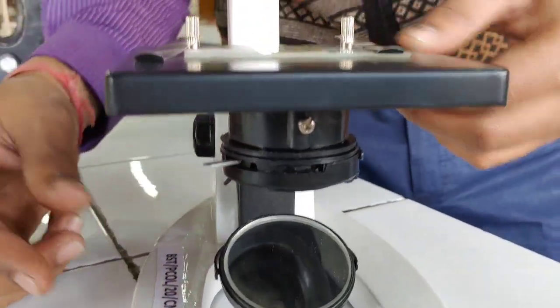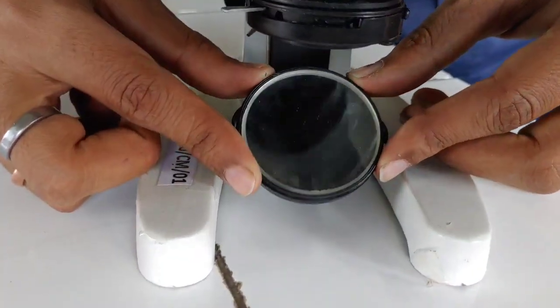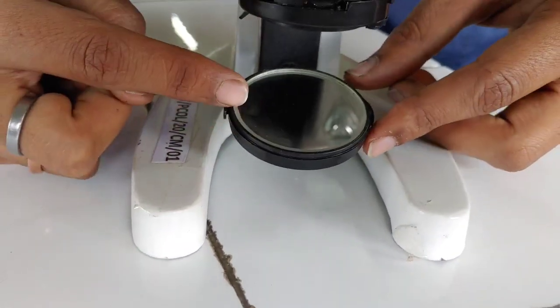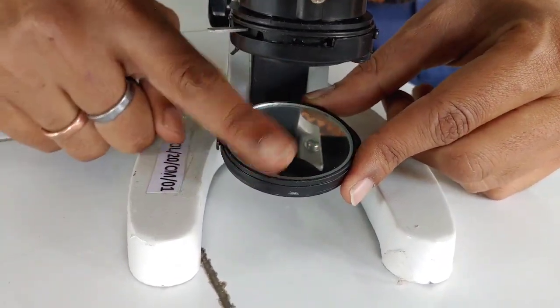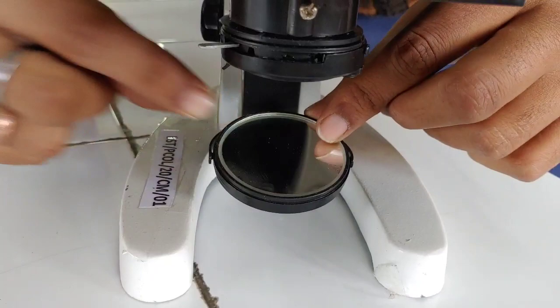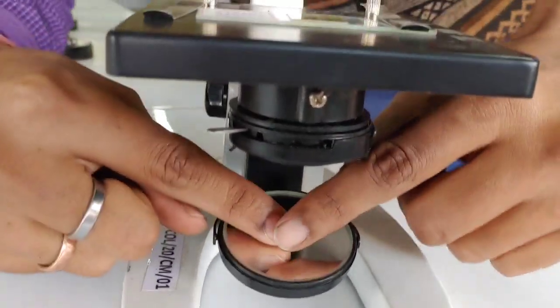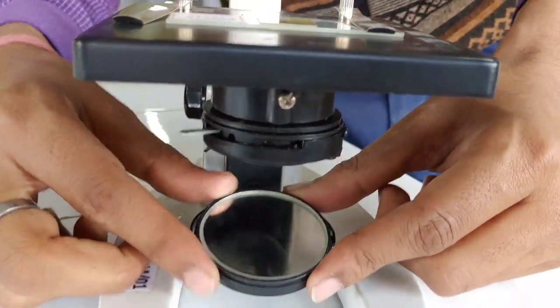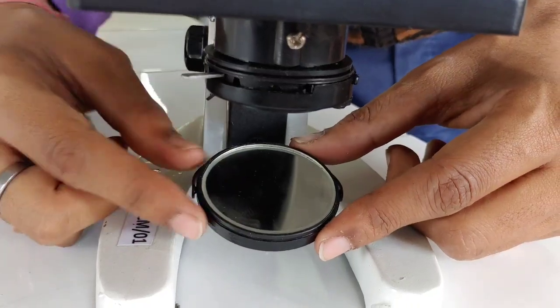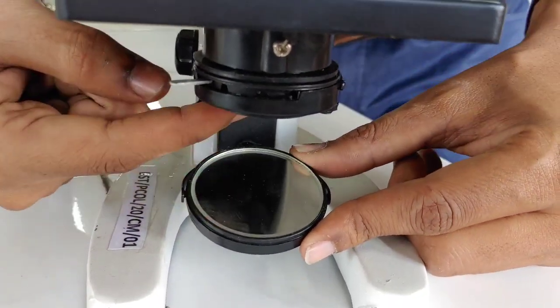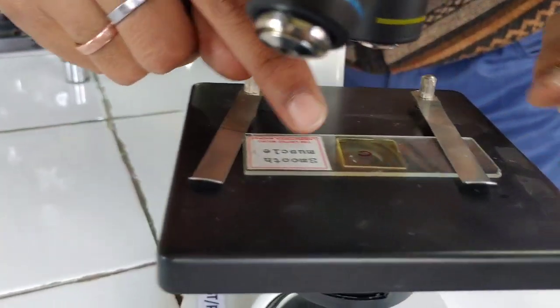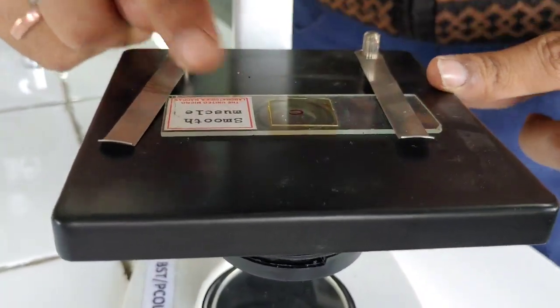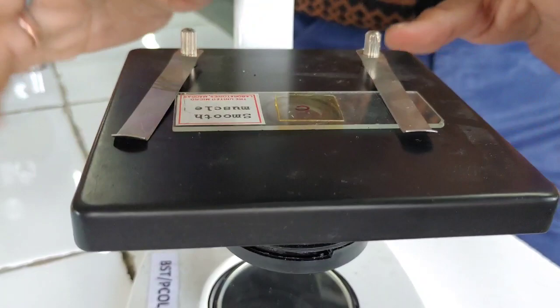Now, next is mirror. Mirror is double sided with one flat side and another one is concave side, which is present below the condenser. It focuses the light wave into a solid cone of light onto the specimen under study and help in resolving the image.